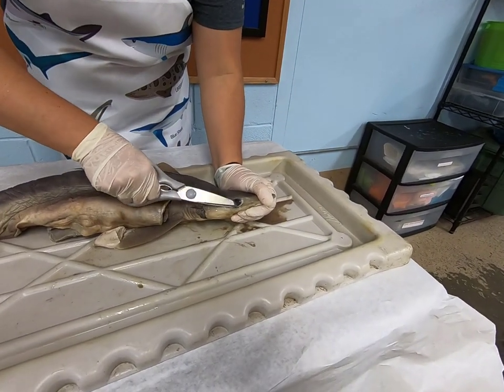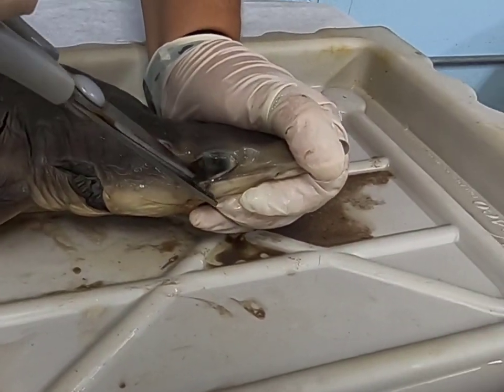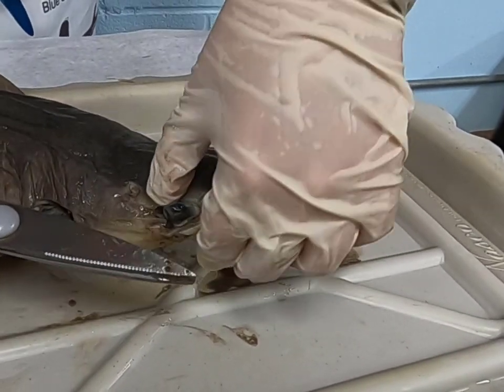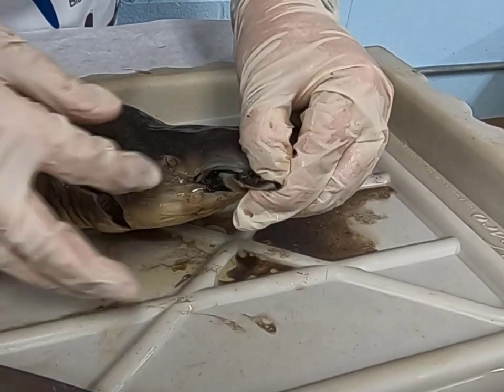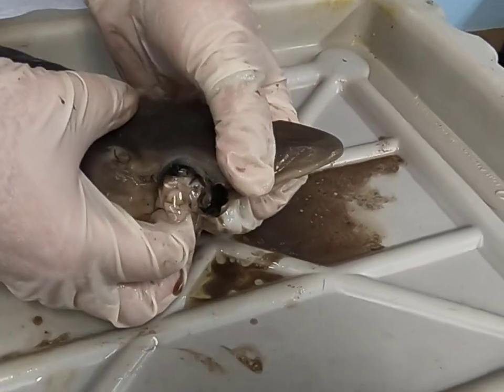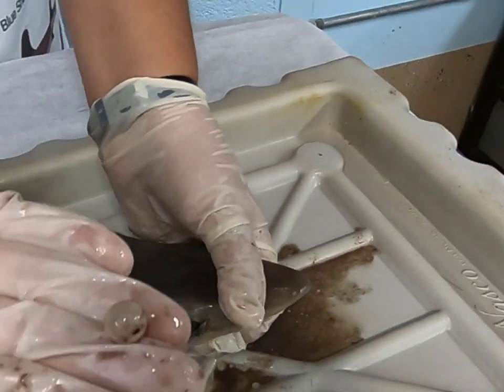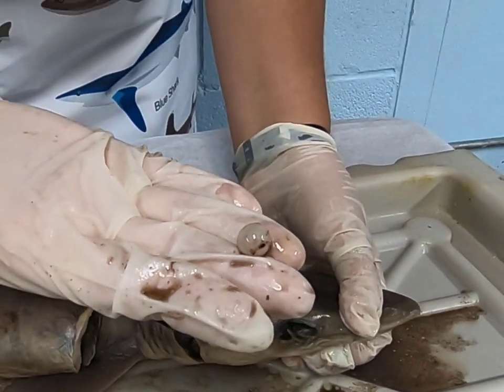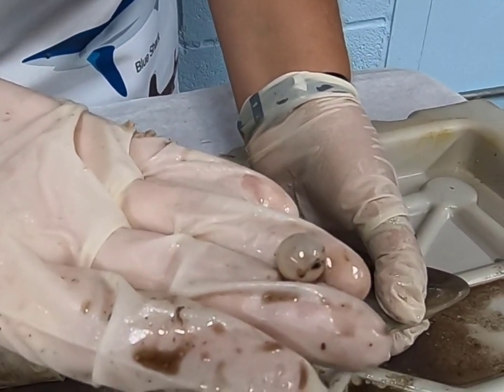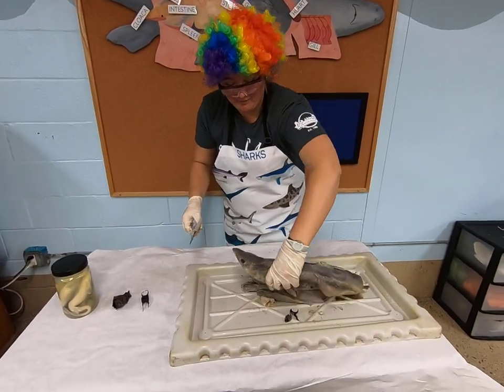Woo! There's a little bit. Oh yeah, look at all those juices in the eye. How interesting and scientific, and wow, look at that gel coming out. Oh, and here is that lens, that round lens that allows them to see through water. Let's do the other eye. I'll skip that one.